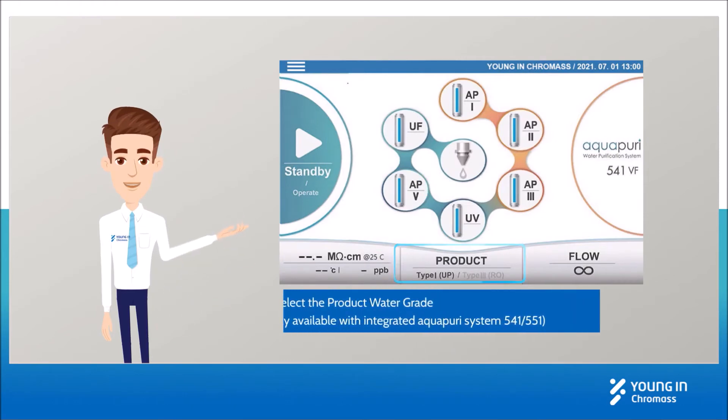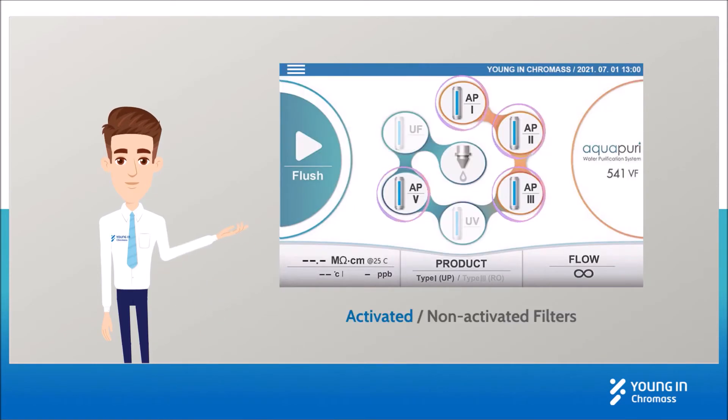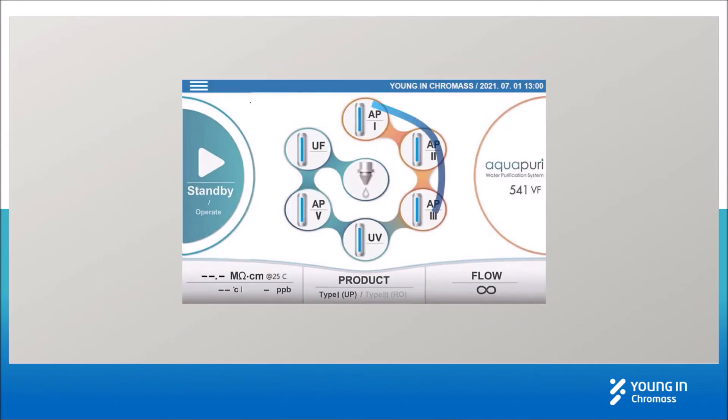Select the product water grade by clicking on the LCD. It shows activated and non-activated filters. It also shows the flow diagram, which differs depending on the product water grade.